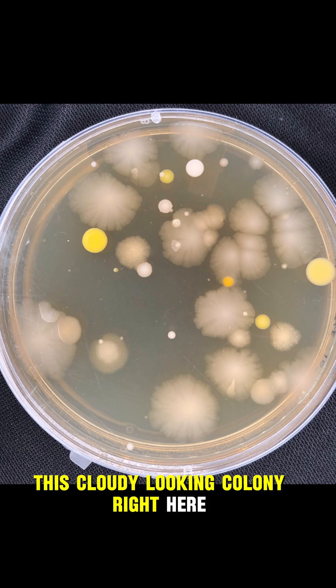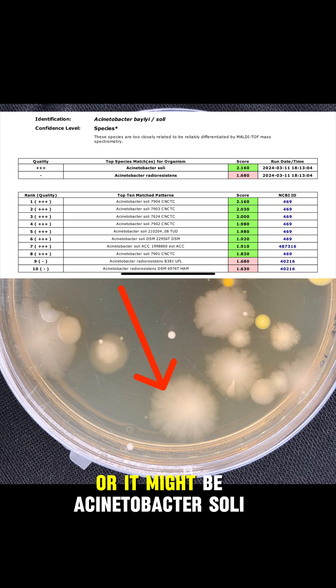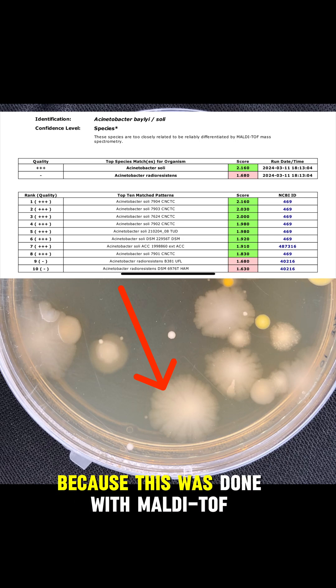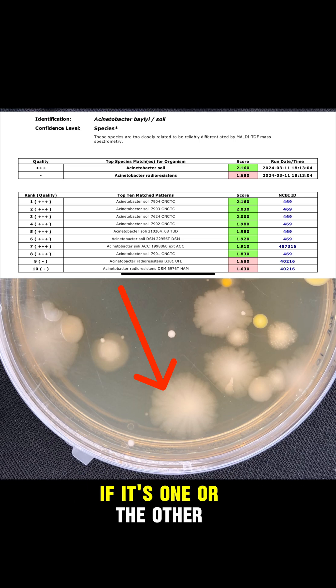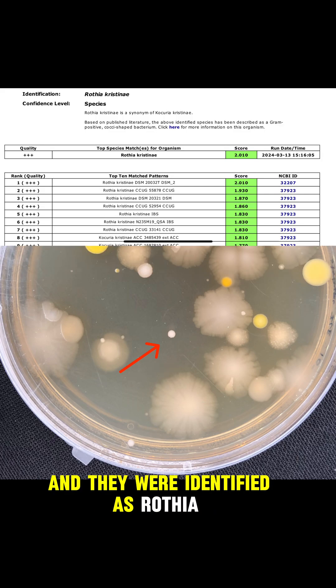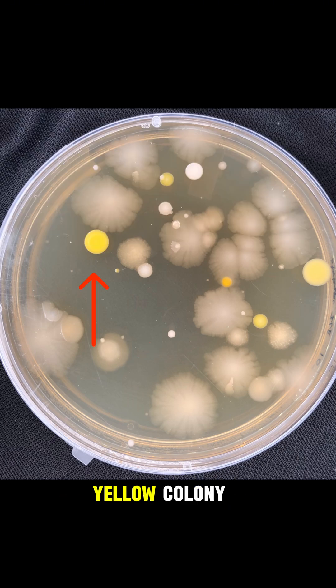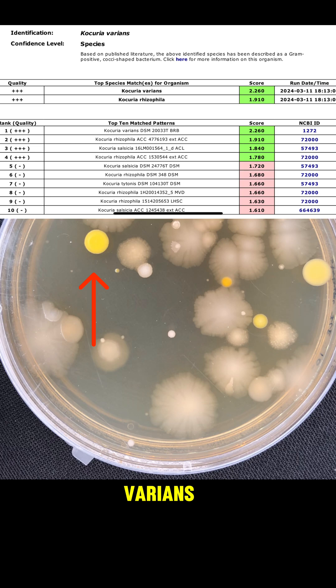This cloudy looking colony is actually called Acinetobacter baeoli, or it might be Acinetobacter soli — because this was done with MALDI-TOF, they weren't able to distinguish if it's one or the other. Next up are these white colonies, which were identified as Rothia christinae. And lastly, this big yellow colony was identified as Kocuria varians.